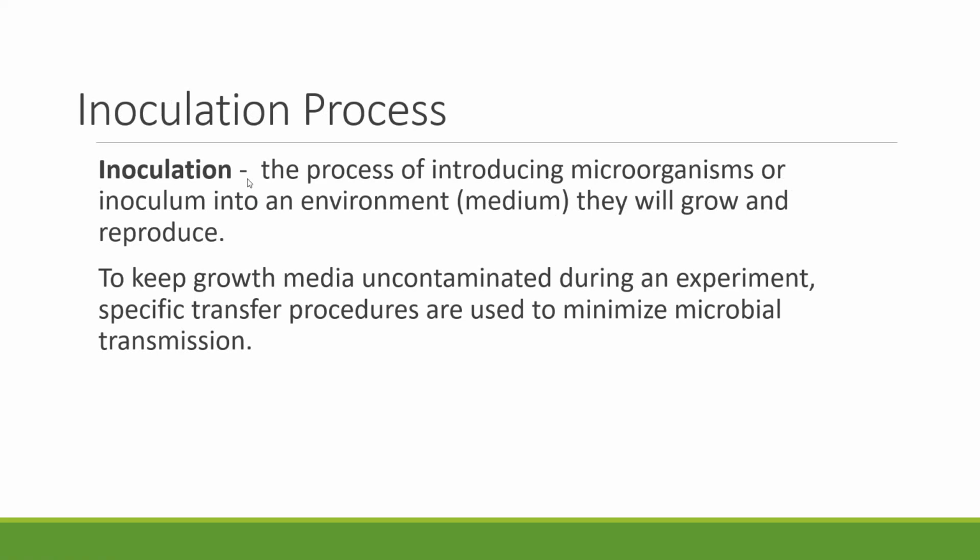Another term just before we begin is the term inoculation. So in lab, many times what you're trying to do is move a microbe sample from one test tube or plate onto another plate or into another test tube. That process of moving that microbe and introducing it into a new environment is called inoculation.